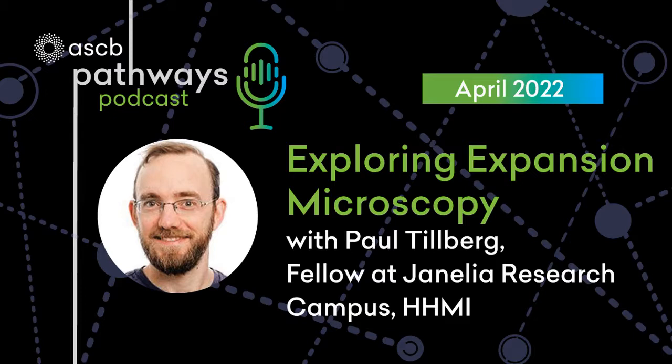Do you see this as a way of democratizing imaging science? Yes, definitely. Absolutely. That is, I think, one of the big hopes for this technology. I think the biggest caveat to that, however, is that when you expand as much as we do, you expand fourfold, that's 64x in volume, your signals get very dim. So for a sort of 3D extended structure, the signal will be literally 64 times dimmer and more like 100 times dimmer because we lose approximately half of the fluorophores.